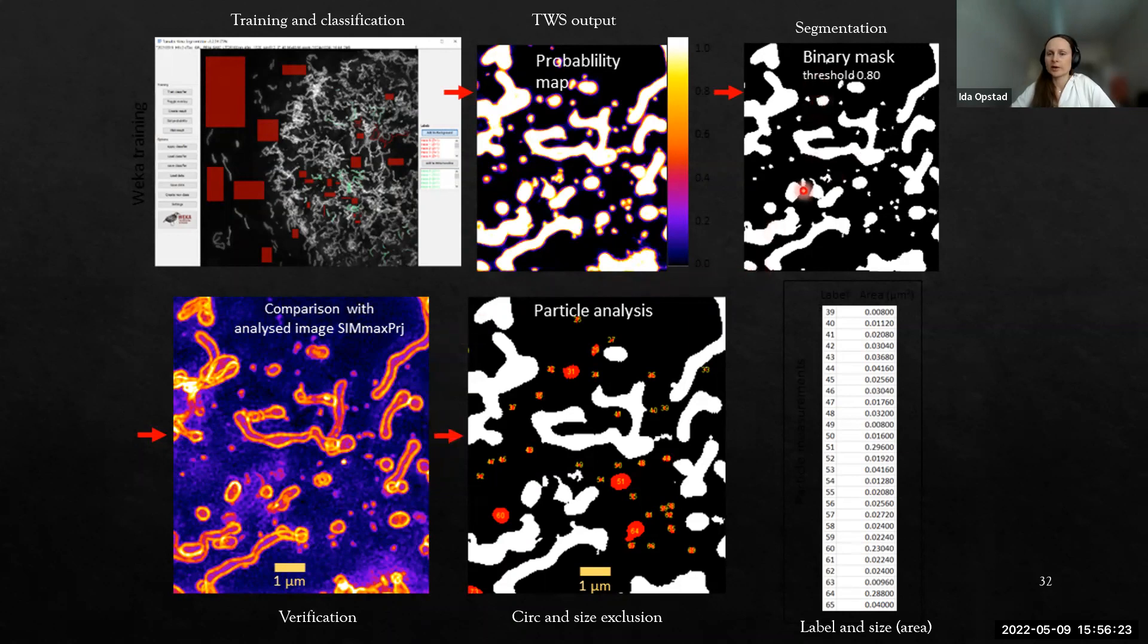With this binary mask, I just used the standard particle analysis plugin in Fiji or ImageJ. Then I used size exclusion and also shape, a circularity above 0.7 I think I used, and tried to find a reasonable size. Maybe the largest of these are a bit too large to be characterized as mitochondrial derived vesicles, but it's hard to decide. Overall it seemed to work really well.